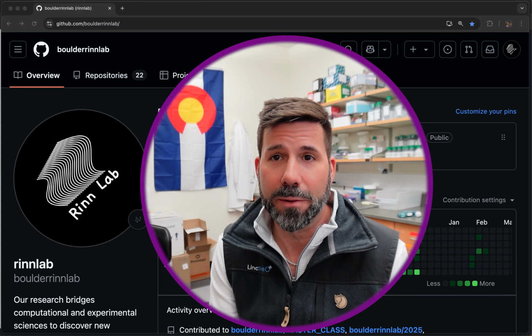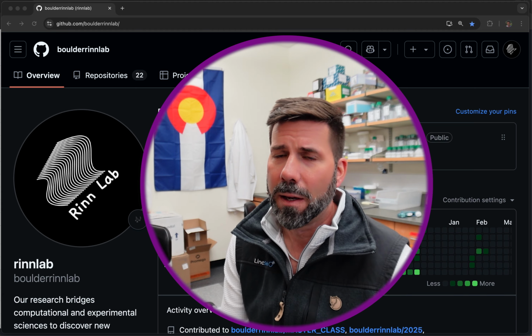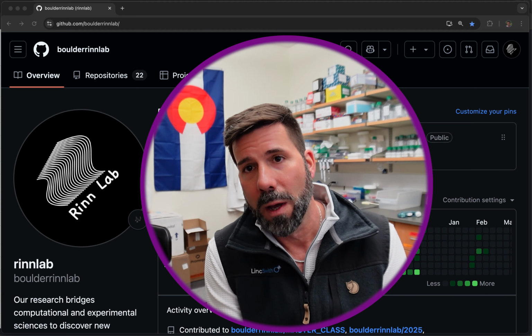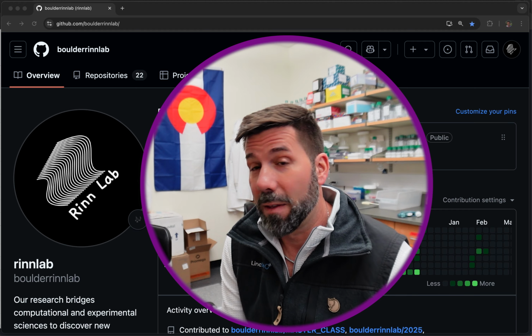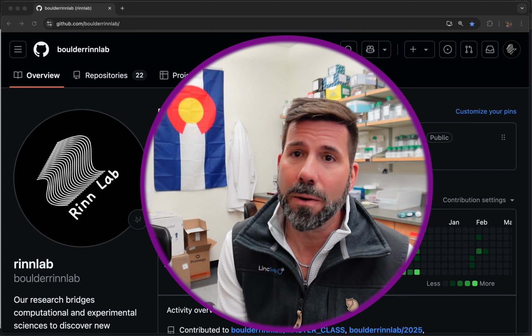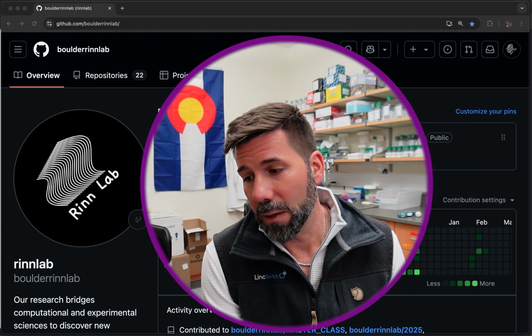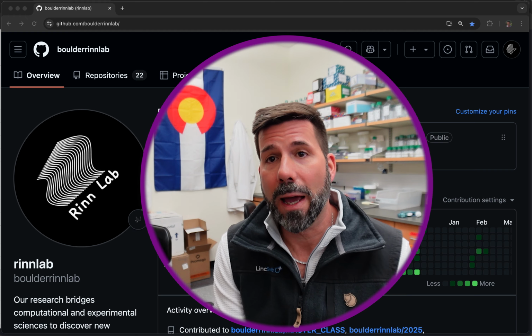If you're here, that means you've run the Nextflow nf-core pipeline for ATAC-seq, I think version 2.12, and that must be awesome because we now have tons of data, just like we did in the RNA-seq video. The nf-core ATAC-seq pipeline will do a bunch of analyses for us, and that's what we're going to take a peek at today.